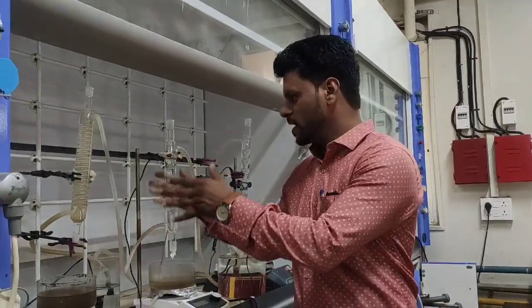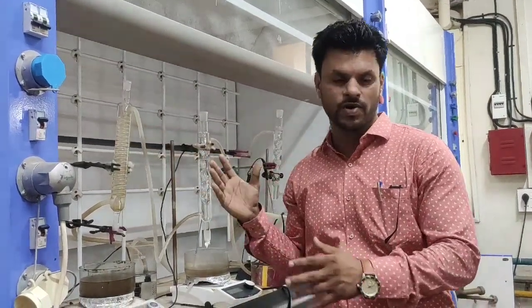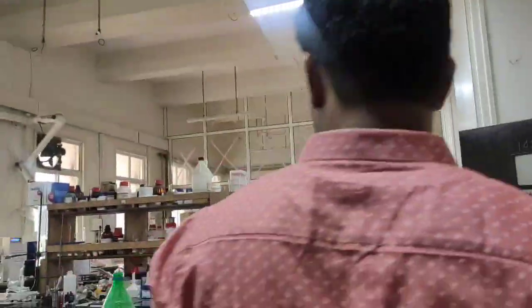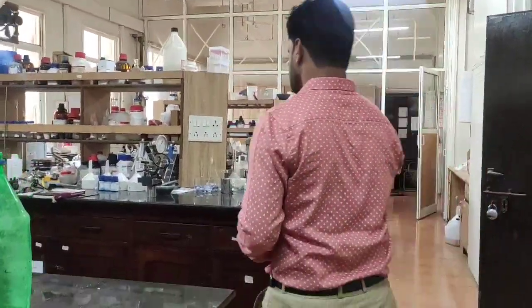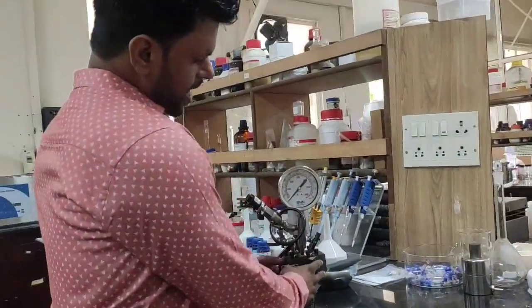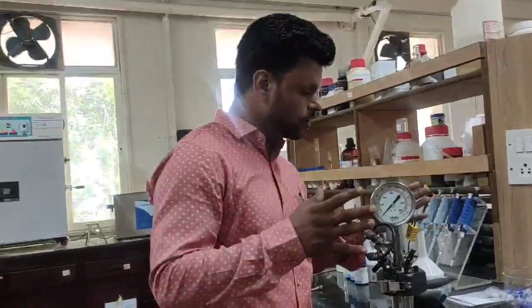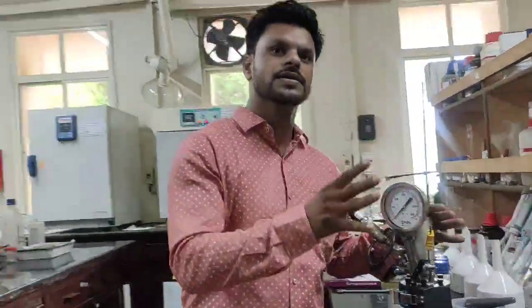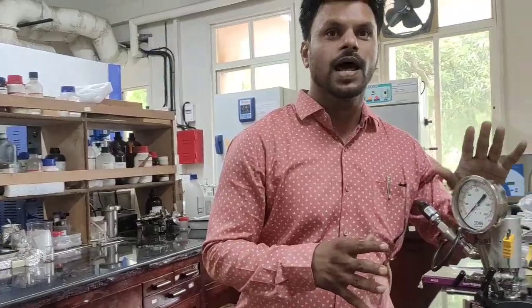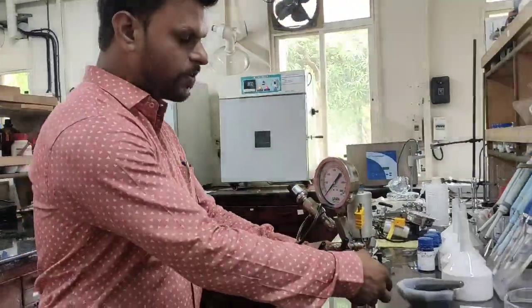So this kind of RB and condenser won't work. That's why we require the high quality power reactor. This is a steel reactor and you will be happy to listen that this reactor can go to nearly 300 degree Celsius and at almost 100 bar pressure.